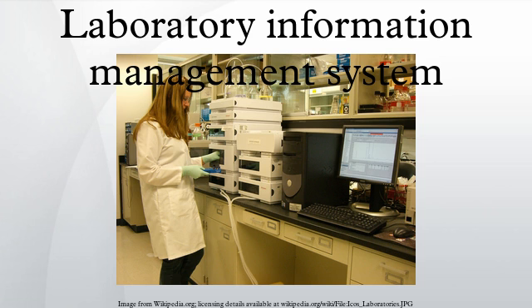The registration process may involve accessioning the sample and producing barcodes to affix to the sample container. Various other parameters such as clinical or phenotypic information corresponding with the sample are also often recorded. The LIMS then tracks chain of custody as well as sample location. Location tracking usually involves assigning the sample to a particular freezer location, often down to the granular level of shelf, rack, box, row, and column. Other event tracking such as freeze and thaw cycles that a sample undergoes in the laboratory may be required.